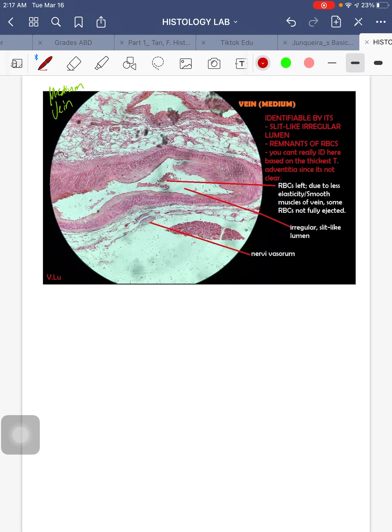Medium vein: we identify this by its slit-like irregular lumen. There can be remnants of red blood cells — very evident here. You can identify it by the thickness of the tunica adventitia, which is the thickest layer for veins. They have a diameter of 1 to 10 millimeters, their tunica media has 3 to 5 layers of smooth muscle cells, and their tunica adventitia is the thickest layer.